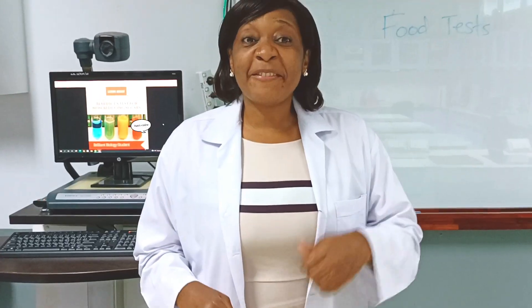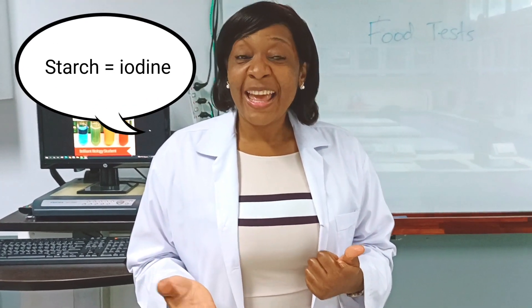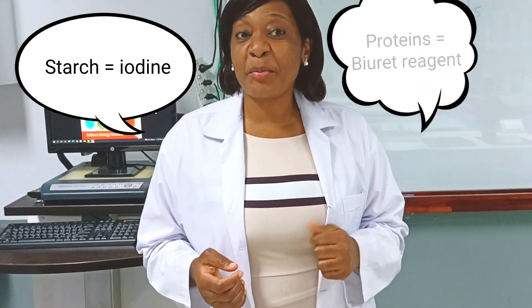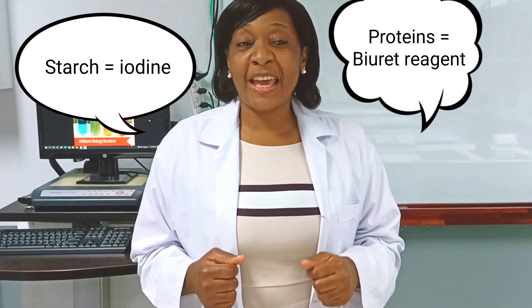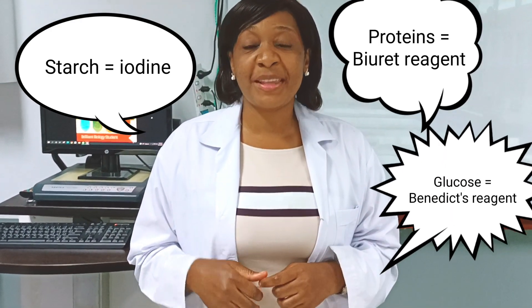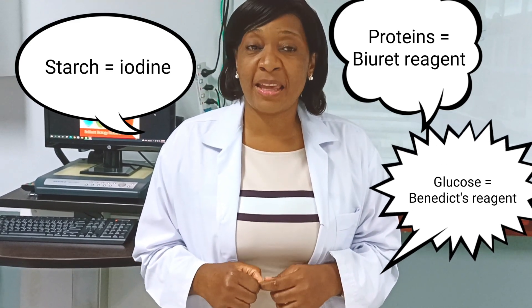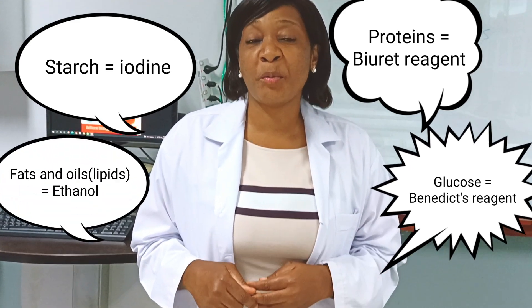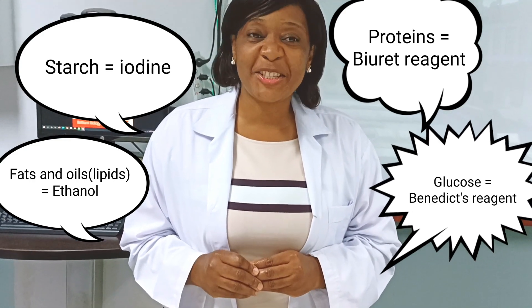The four main types of food tests we'll carry out in this video are: the test for starch, using iodine; the test for proteins, using biuret reagent; the test for glucose, using Benedict's reagent; and the test for fats and oils, using ethanol.